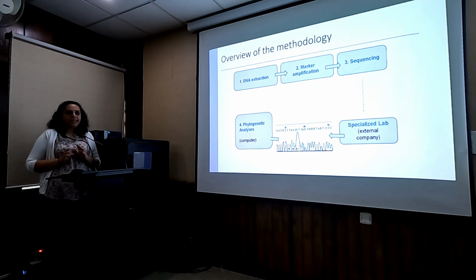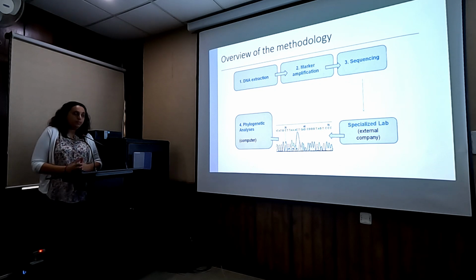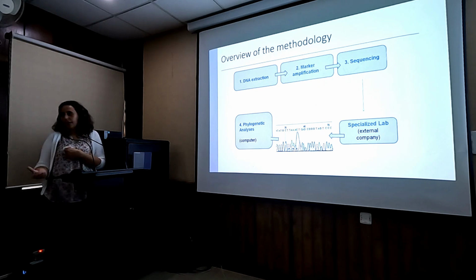Okay. So the several steps of the lab work. You take the samples, you extract the DNA, you copy the regions that you're interested in for your analysis, you send the material for sequencing. Normally it's outsourced, so you send it somewhere to be done by other people. You get your sequences back, and then you analyze them on your computer.